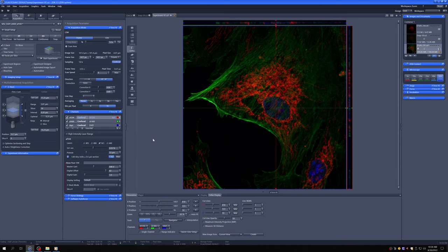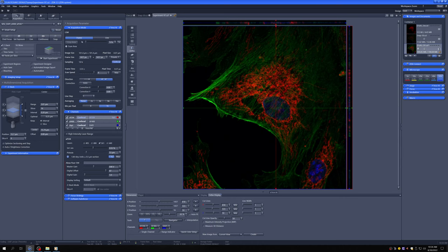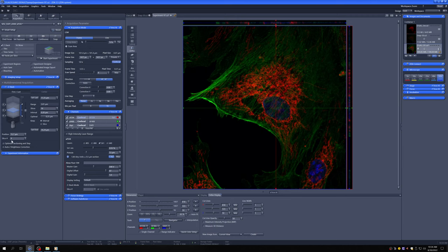So that's pretty much all there is to the basics of taking a Z stack. You can also define Z stacks based on the middle and then just say, okay, we want a certain range. So we always want to take three micron Z stacks. So you could do that here. That also works. That's a possible approach. But for most people, for most things, what I've discussed pretty much covers it. There's really not that much more to Z stacks.